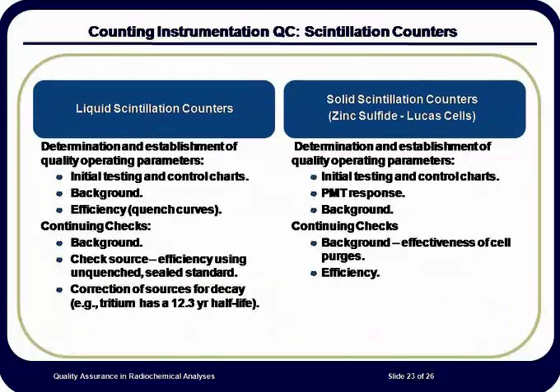Lucas cells are the other type of scintillation counter used in the radiochemistry laboratory. Each cell must be calibrated with its own photomultiplier tube. Each PMT and cell combination must be checked and used together as the calibration is geometry specific. Since each cell is used to trap the radon gas that is purged from the radium solution, the decay products of radon are also trapped in the cell. The background for the cell plus the PMT must be determined and plotted immediately prior to each use.